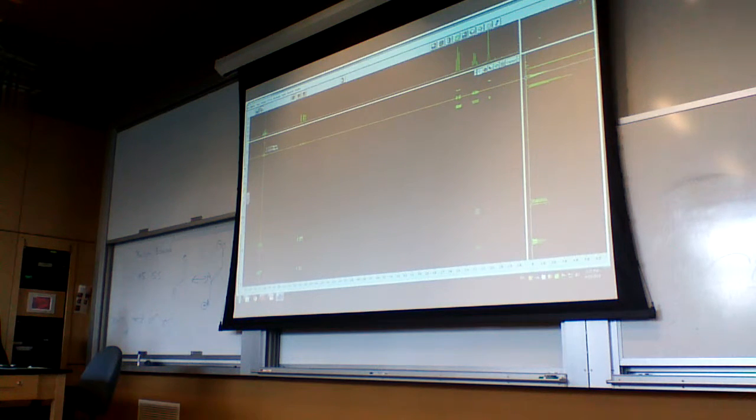C and D. That one's E. This one's D. Okay. This one's D, this other one is C. Yes. So this one's C, C, and then we had F and E and B and A. And so we see the coupling between D and C.